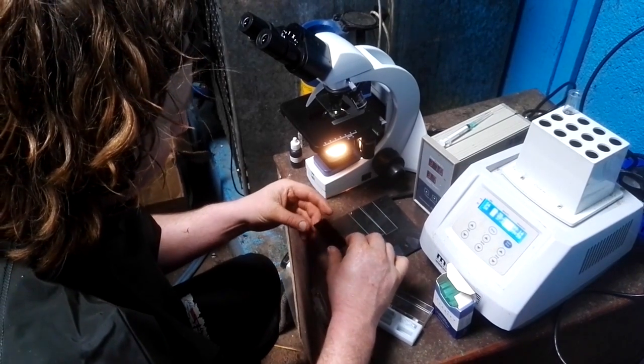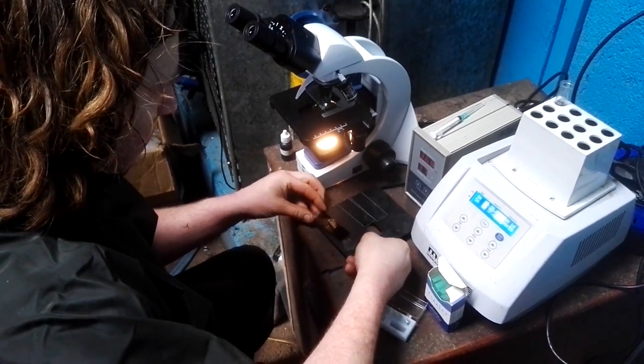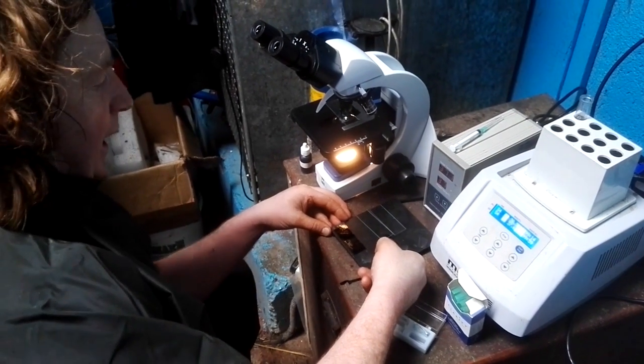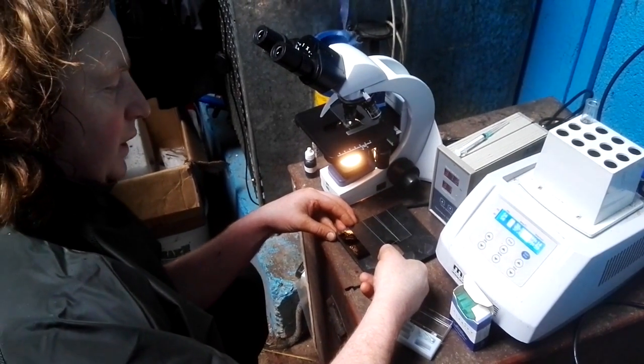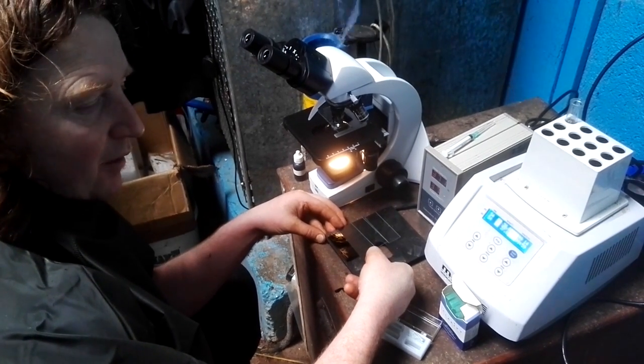We'll dry that now, balance this up, put it on a level surface. We'll dry that, label it, and I look back in two hours when that's dry, and I look at the morphology of the semen.